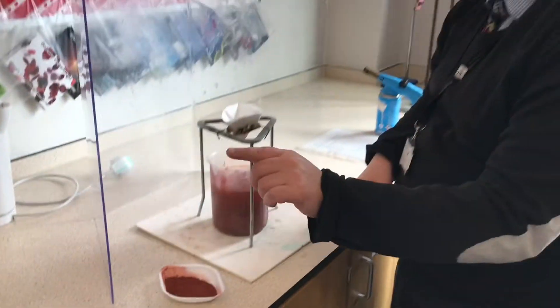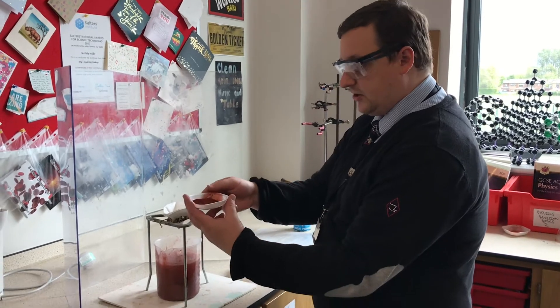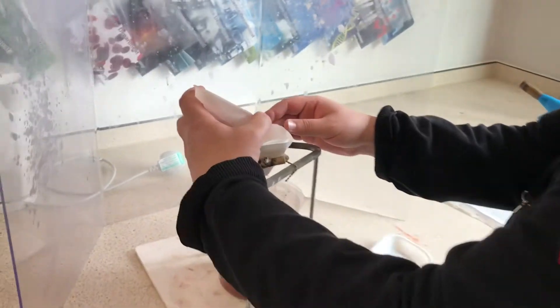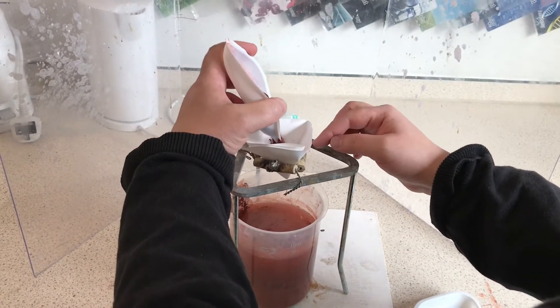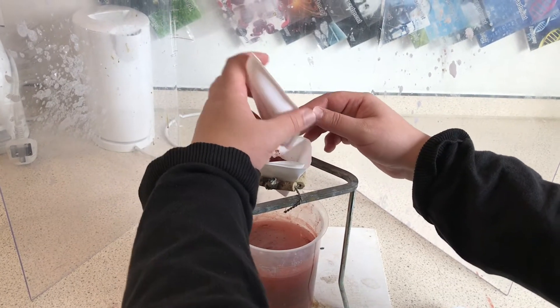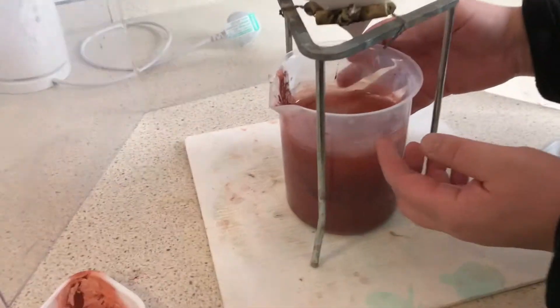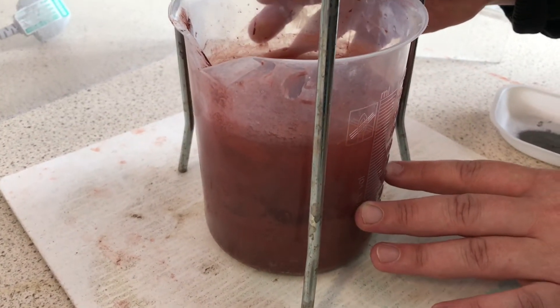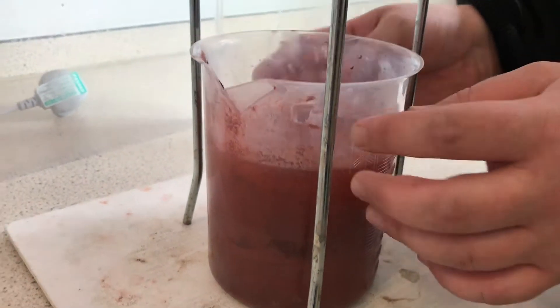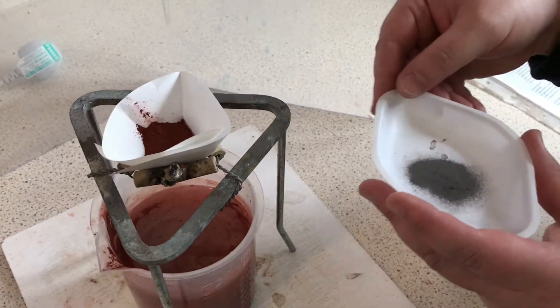We're going to put the iron oxide and the aluminium powder very carefully into this filter paper, which is resting on a clay pipe triangle on a tripod. We also have a beaker — it looks a little disgusting because it's got sand at the bottom with some iron mixed in from a previous experiment, and then there's some water on top of that.